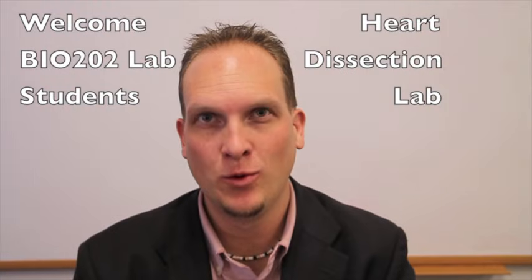Welcome Biology 202 lab students to the Heart Dissection Lab. Today we'll be dissecting a sheep heart and discovering the external and internal features.